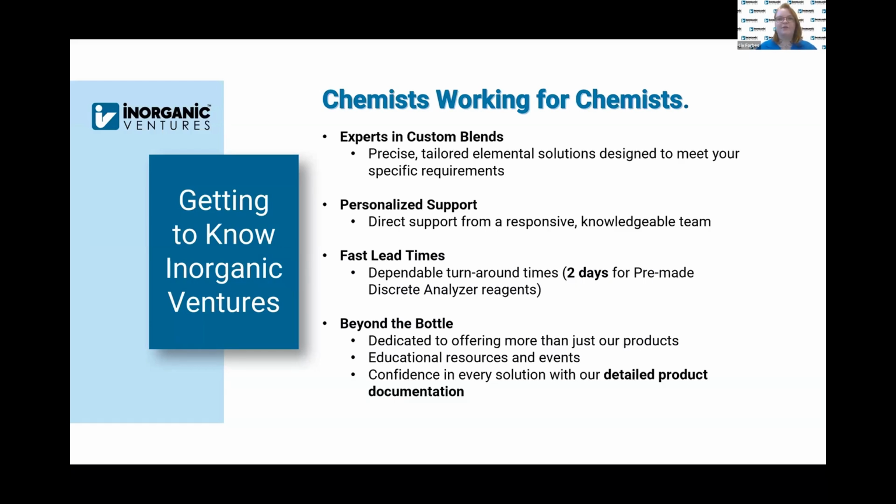Because like I said, if you want to be testing new methods, you're going to have to order all the starting materials, and that's going to take who knows how long, depending on what vendors you're going through. Or, you can just order the reagents for the method you want to try and have them in however long shipping takes.